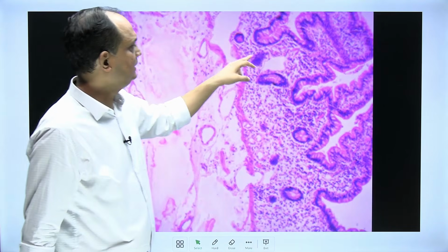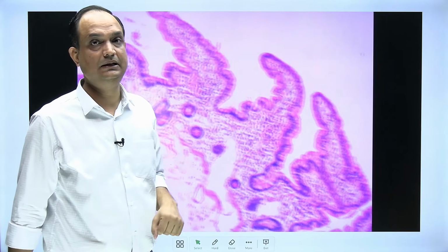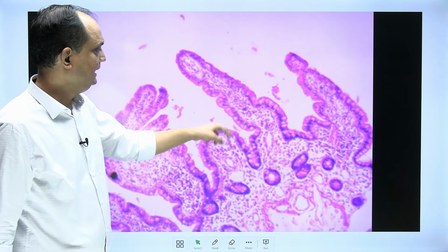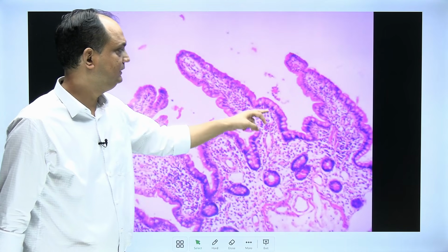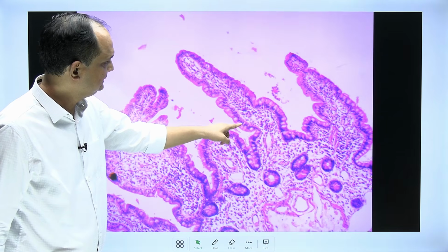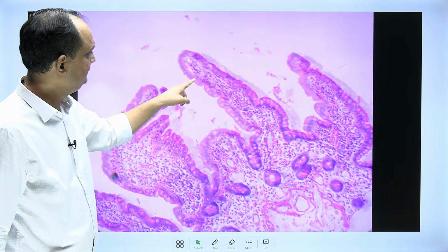So once you are sure about where the epithelium is present, that is the lining or the covering, here I just change the lens. Now I am dealing with the 10x. Now in the 10x, I will find there is a line of the nuclei present.